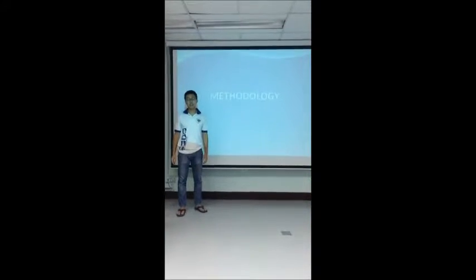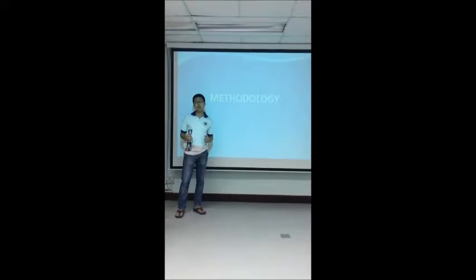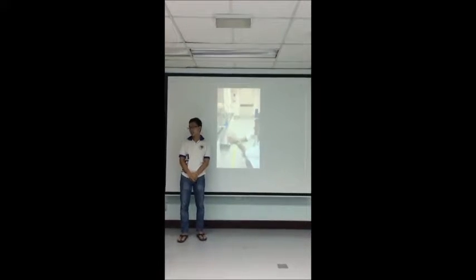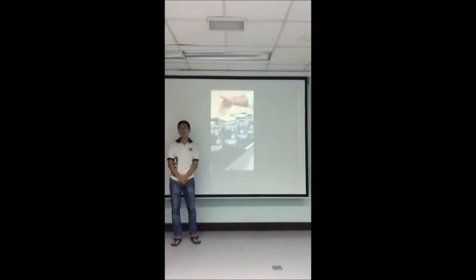My name is Wang Kai Sheng. I'm going to present the methodology part of our experiment 8, which is carbon adsorption. So we have to fill the beaker with 1000 ml of distilled water, and then we repeat for another 4 samples.